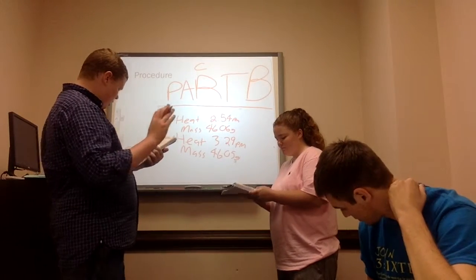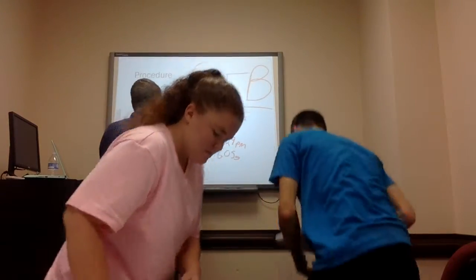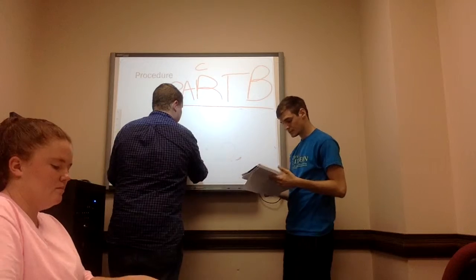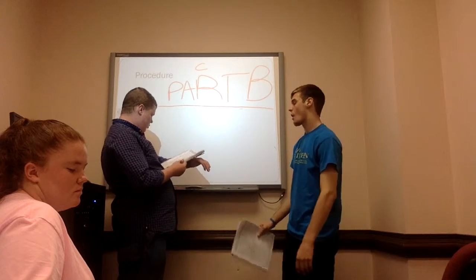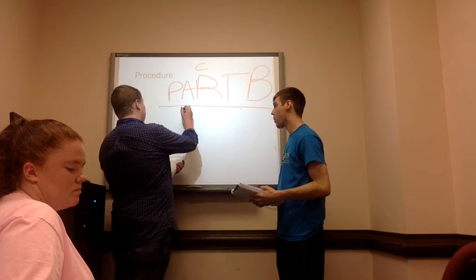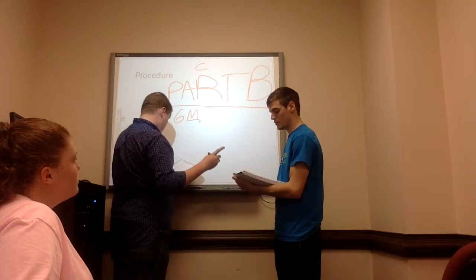And so now, Mr. Crossley, could you come up here just real quick and discuss the very end of that experiment with us? So the mass is within 0.01 grams. And so you poured a small portion of, what's that big M mean? Molar.